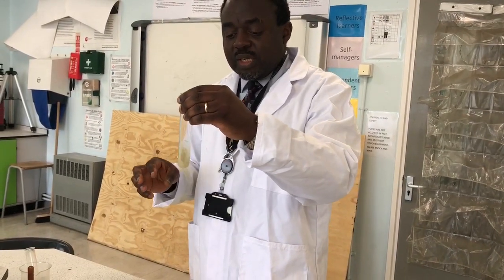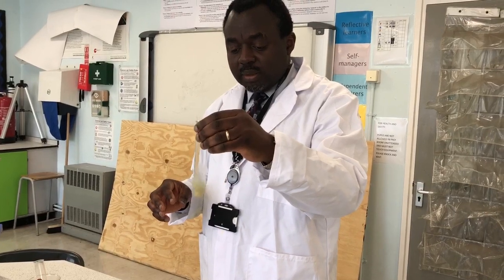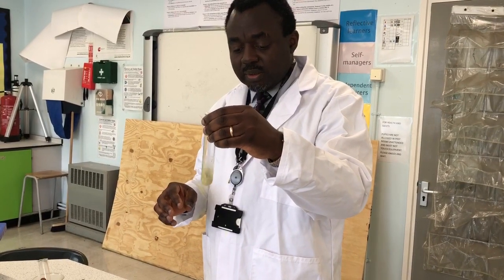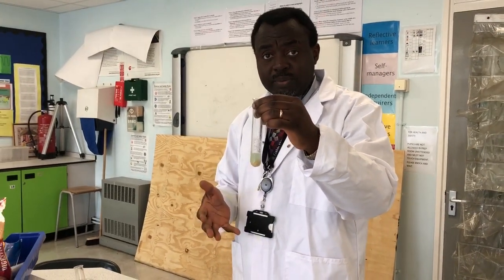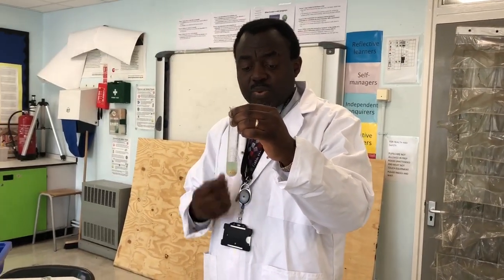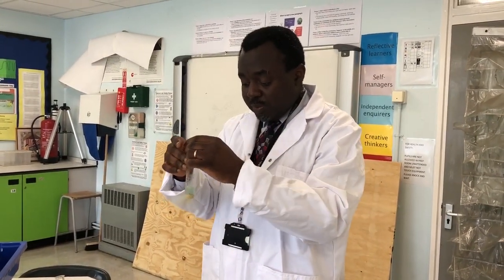Now, if I shake the sample for about 2 or 3 minutes, if the color goes pink or purple, then it means proteins are present.